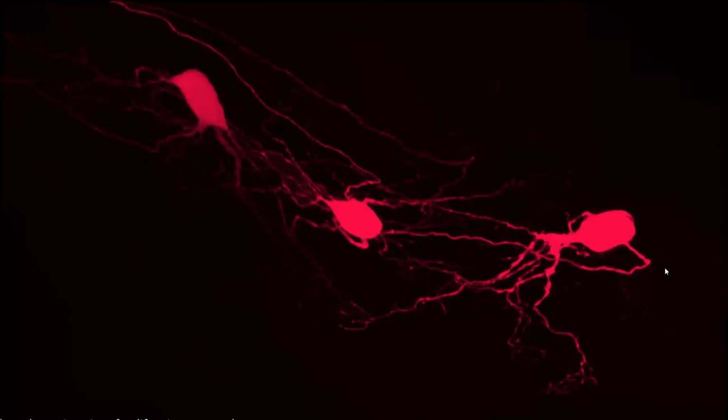To demonstrate employing this terminology in an experimental workflow, we're going to use one of the samples from Dr. John Tompkins' lab at UCLA. This data uses a wide variety of segmentation elements, making it a great demonstration for naming these elements with FAIR terminologies. Segmentation data with FAIR terminologies can be applied to a variety of microscopy image data, though.